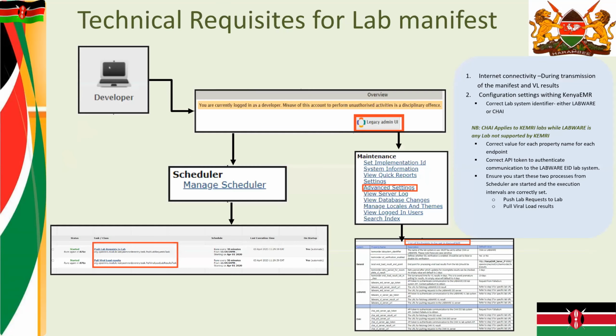So for the technical requirements on the EMR for the module to work, one, you need to have very good configuration. When you are talking about configuration, there are key configurations around specifying the lab type.